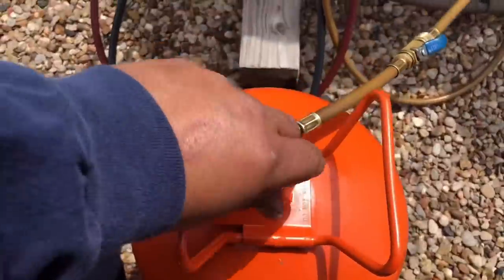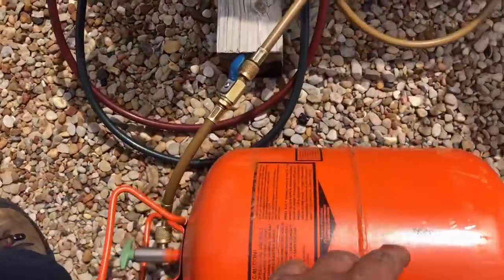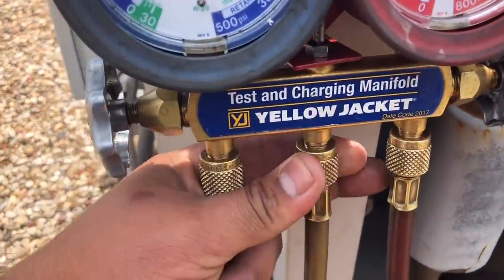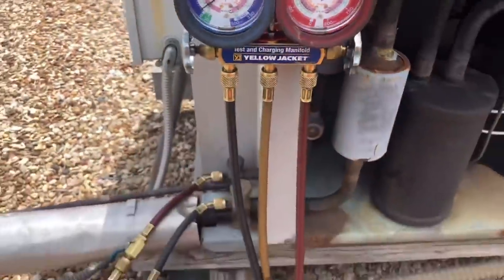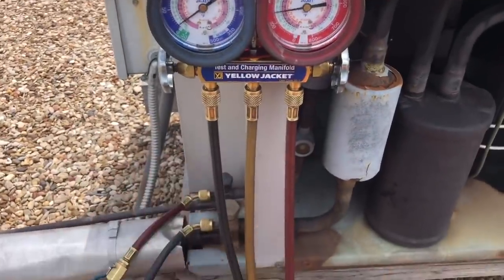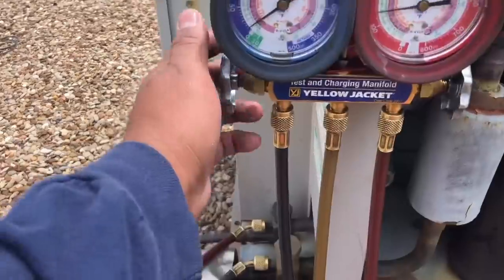Now we're going to open this guy up and flip it. We're going to assume that's all the way open and then purge here. So now our hoses are all free of non-condensables and air. And we're going to go ahead and add gas.